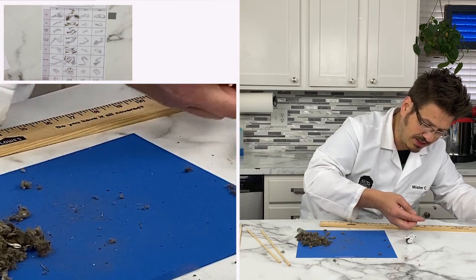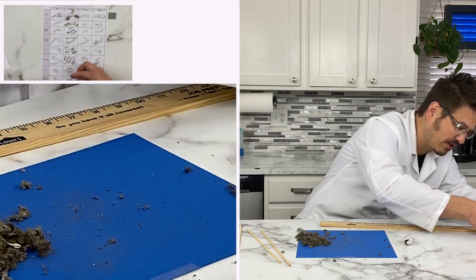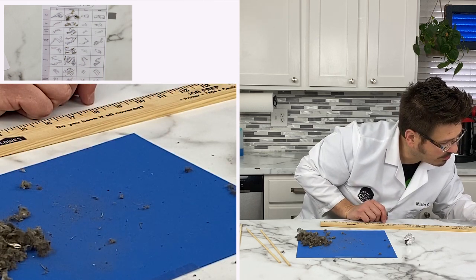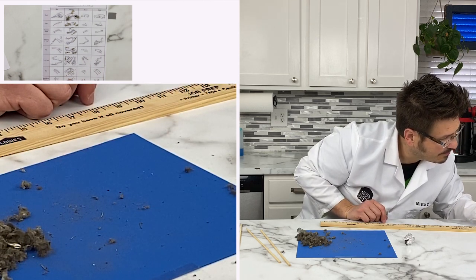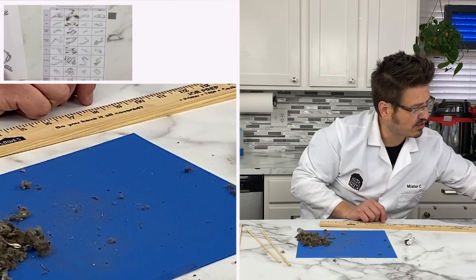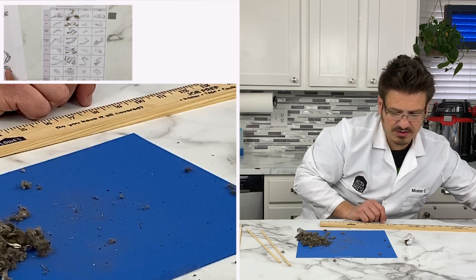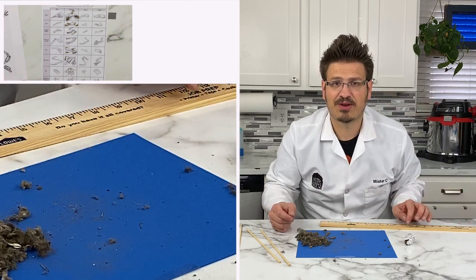Oh, there we go. Ah, it's falling off my hand. There we go. And then I think these little guys right here are vertebrae. I'm pretty sure they are. Because I was looking over here on this other sheet and they kind of look like those as well. So yeah, this is what we get to do on a Friday morning together.